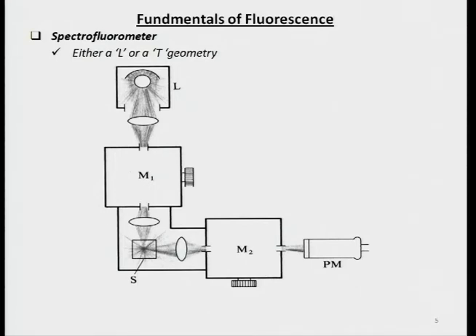Followed by that, you have a focusing lens which allows light to be incident at essentially the center of your sample. Now, this is in essence a single cuvette instrument. These days, obviously, we typically never use it unless we have very few samples to work with. We have high throughput screening assays in which this becomes a well. And the geometry in which you measure is also different, with light either coming from the top or from the bottom.